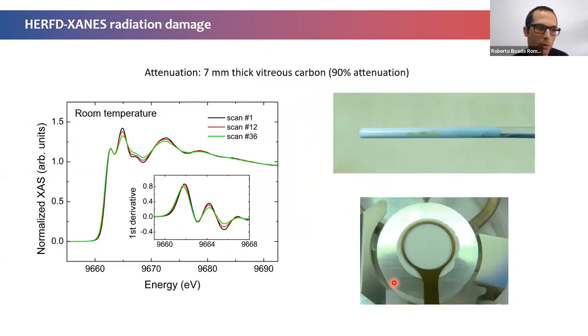Another warning for people thinking of doing experiments with metal organic frameworks is that they are very sensitive to exposure to X-ray radiation, so they are radiation sensitive. Be aware of the radiation damage in your sample, because otherwise you may think that you have some changes, especially when they are subtle. And the thing that you may have seen is the radiation damage. So monitor that.